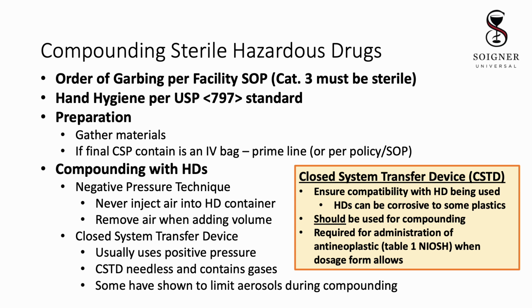after compounding is complete. A CSTD should be needleless and have a protective measure to contain droplets and gases. It's also important to do research on a CSTD to ensure compatibility with the drug in the CSTD, since some antineoplastic drugs can be corrosive in nature.